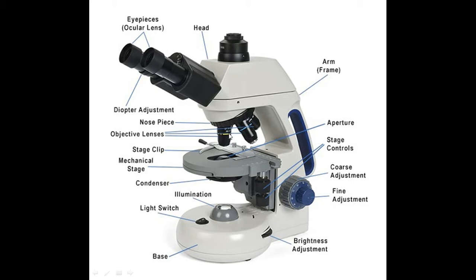It comes with different magnification schemes. We have that one that magnifies the image of the object 4 times. You can have 10 times, you can have 40 times, and 100 times. So it comes with different magnification strategies.